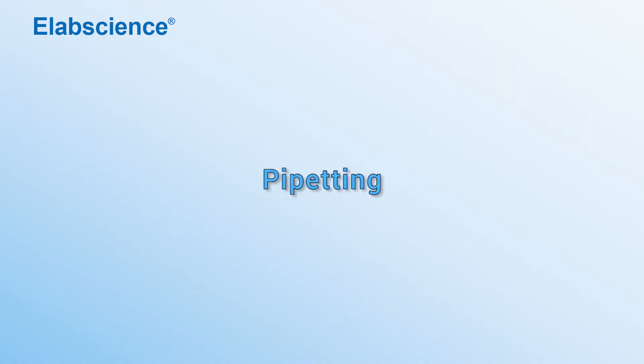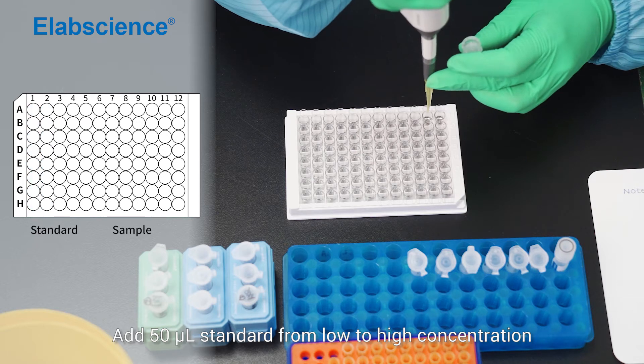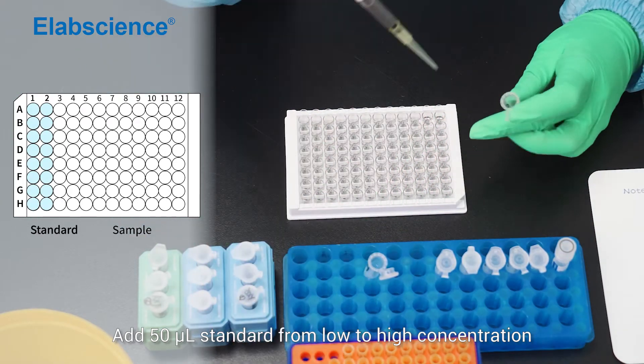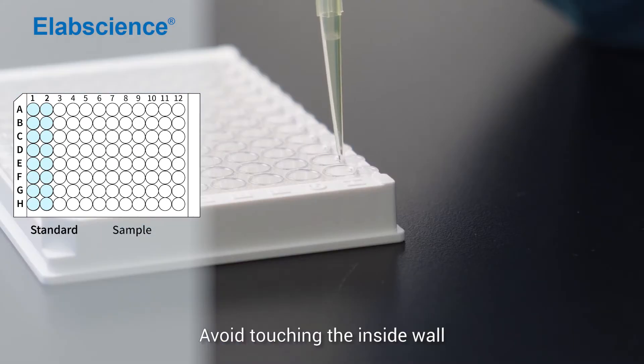Pipetting. Add 50 µL of standard from low to high concentration. Avoid touching the inside wall.